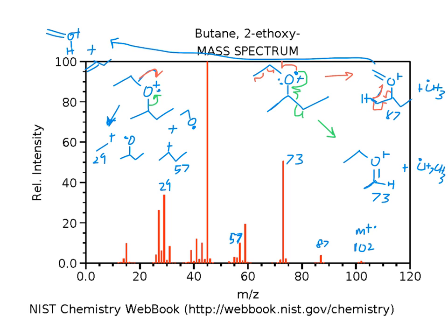We had the first, right, so we first had the ion at 87, and we observed that, a small amount, and then that further fragmented. But this one isn't really where I wanted to end up. But let's see, this would be 31, I believe, which is really small right here.